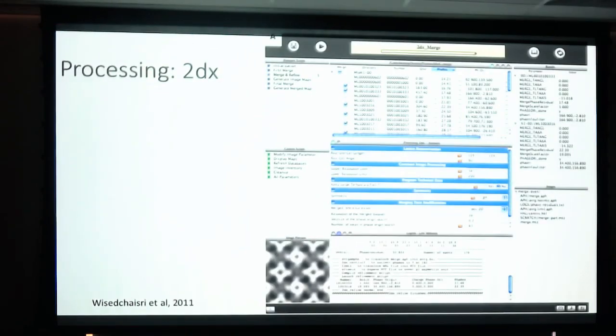And then once you did collect your images, the software also was not exactly easy to use. It used to always be these old Fortran scripts, and you'd have to edit these scripts and all that. Sometime in the 2000s, they came up with this nice graphical interface called 2DX, which gave you an interface to process your 2D data. You'd have to index your diffraction pattern and decide which micrographs are good, and if you're doing imaging, you'd have to determine the CTF of everything. It had quite a complicated interface to do all this, but it did let you do everything at least. I don't know how many of you have used Relion and thought that was complicated, but compared to that, this was really complicated, I think. But anyway, it did work. It let you do a lot of 2D stuff.